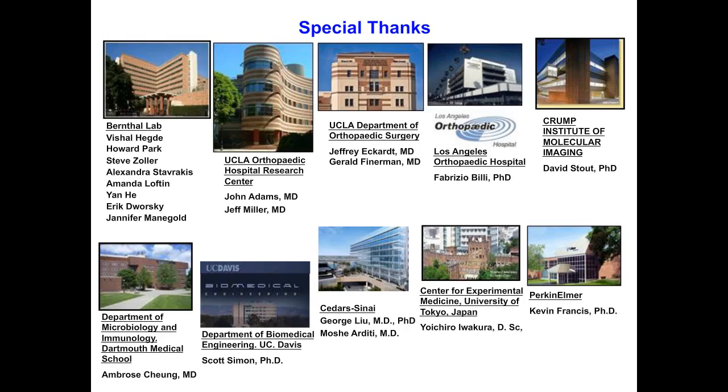We have an audience member who submitted a question saying, I am imaging intracranial tumors after implantation. Will the skin glue on the mouse head affect the luciferin imaging accuracy?